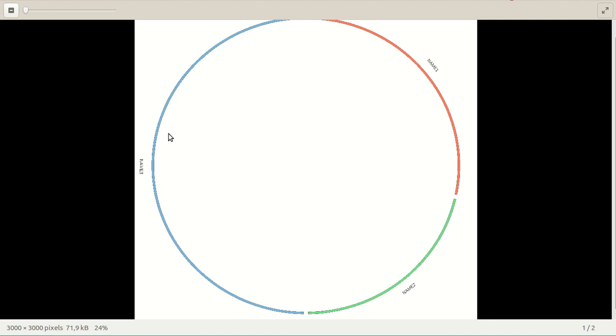Well, hello everyone. Here in this video I'm going to show you how to create these plots, charts, and some with some modifications. The purpose of this is because in the tutorial website of Circos, it starts very complex, so you don't see how to actually create the basic nodes or structures to build this kind of graphics.